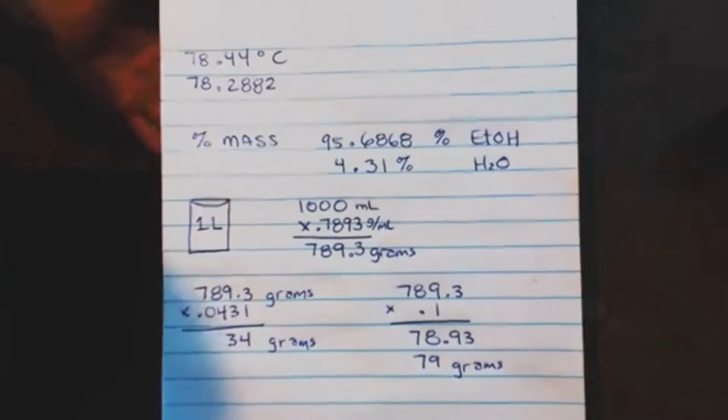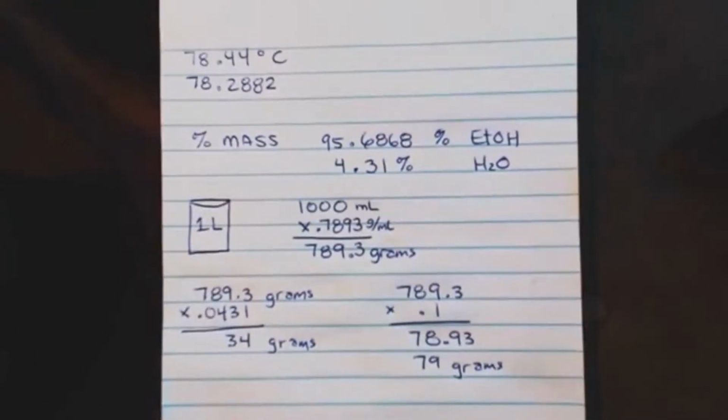And when you do this, you don't just do it for 15 minutes. If you want really anhydrous alcohol, you're going to have to go past 15 minutes. You're going to have to store it for like 24, 48 hours to make sure that you get all the water out. If you just want it basically dry, yeah, just throw some in for 15 minutes and let it stir. It's the last couple grains of water that's really hard to get out of there.